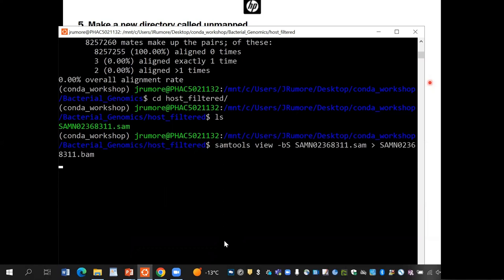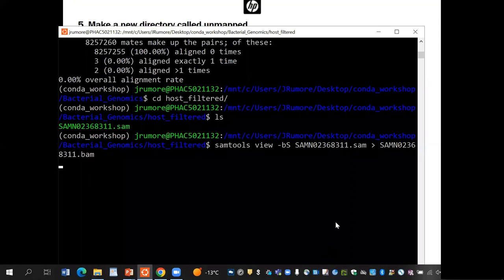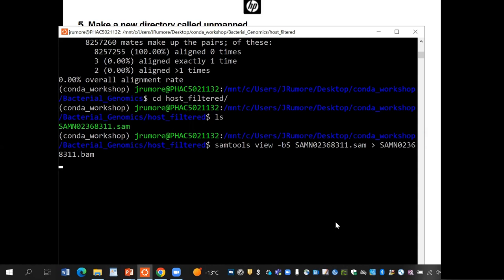So it shouldn't take as long. I'm just going to make sure that everything is progressing as it should. Yep. So it'll be about half the size of the SAM file. Just to check, everyone, is it good in the room and online? Okay, perfect.